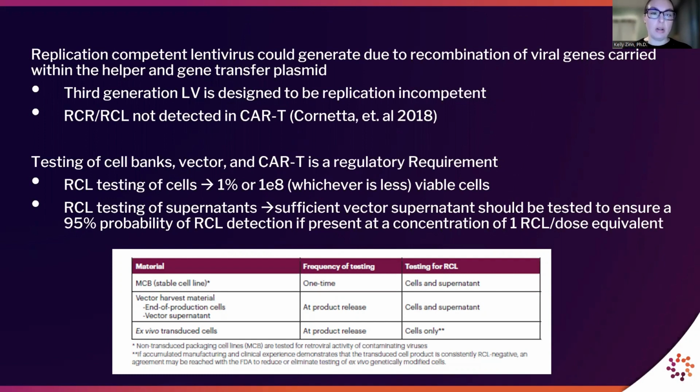So as I started off in the talk, I talked about the third generation lentiviral vector, which is designed to be replication incompetent by segregating viral elements across 4 plasmids and removing key lentiviral elements. And the engineering of replication incompetent lenti and retroviral vectors has been successful.